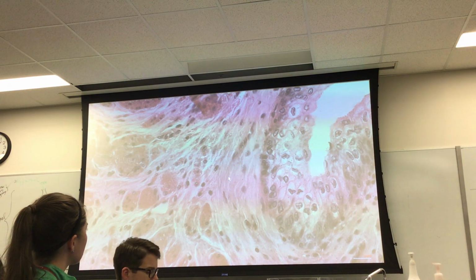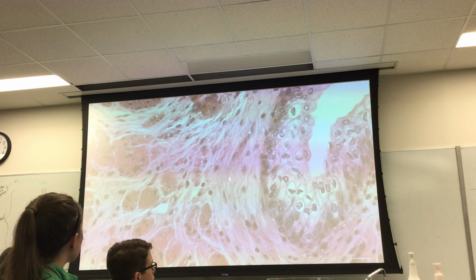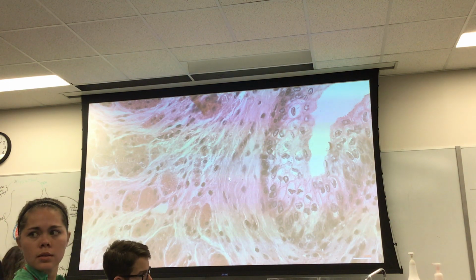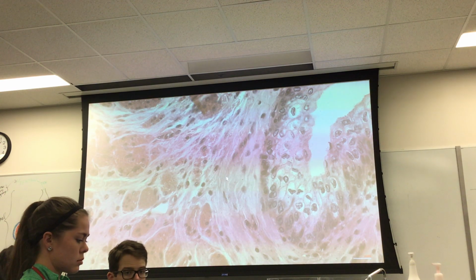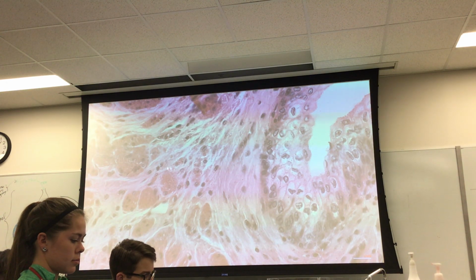It's connective tissue. So if you run through the connective tissues, fibroelastic connective tissue, but now the question is, is this loose or dense irregular? What do you think? I'm going to go with dense irregular on this, simply because it's not lined up enough. That is, the collagen is not lined up in these big fibers.